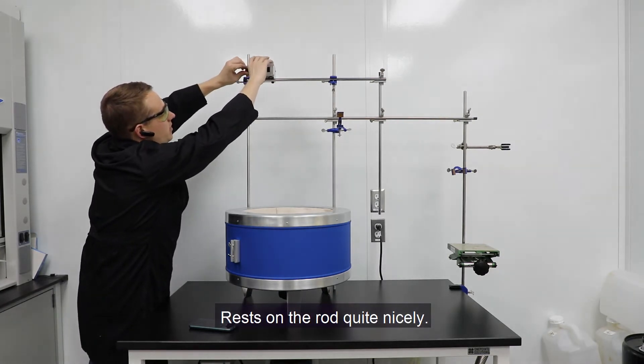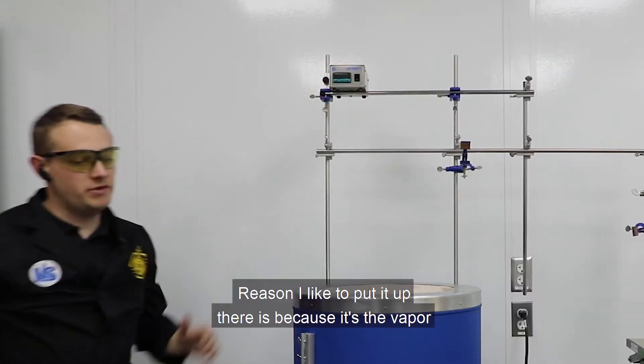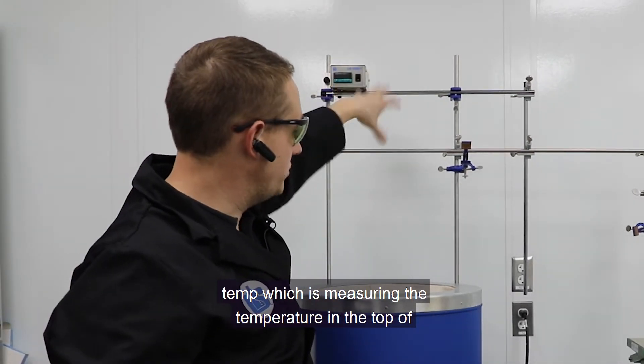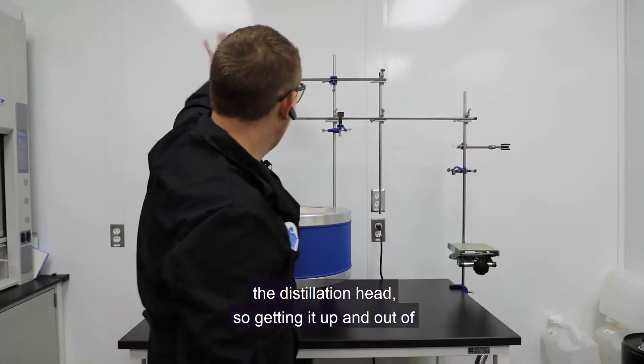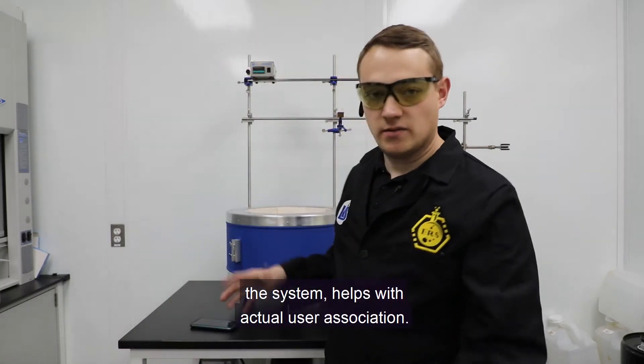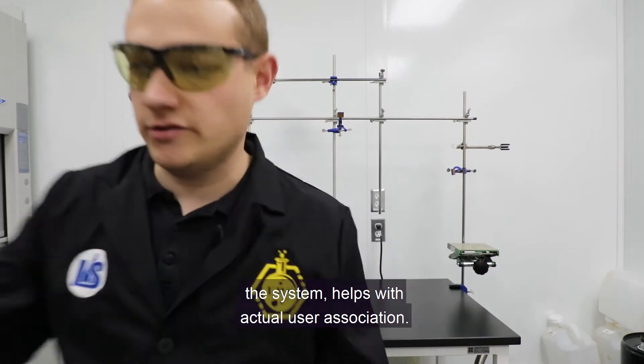It rests right on the rod quite nicely. The reason I like to put it up there is because it's the vapor temp, which is measuring the temperature at the top of the distillation. So getting it up and out of the way, but in a spatial location that makes sense on the system helps with actual user association.